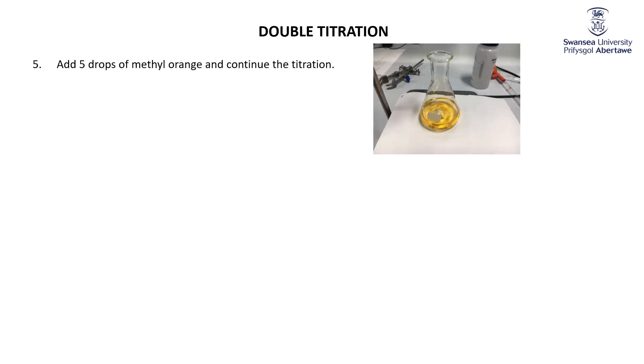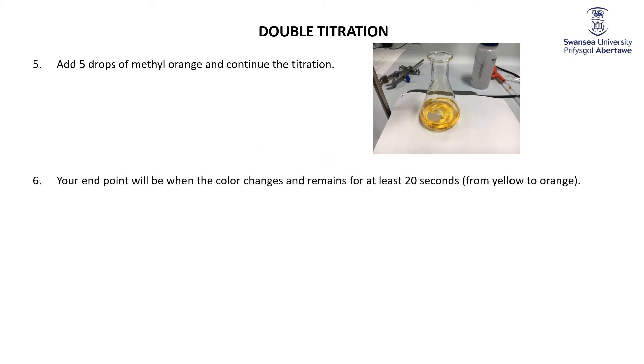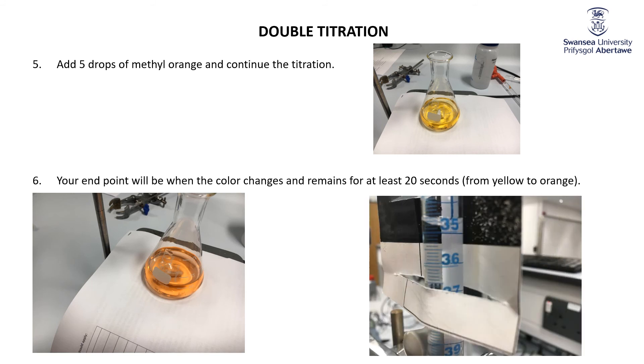Then we add in the methyl orange, which turns it yellow, because now we're on the basic side of the color change — methyl orange is yellow in base. Keep adding the titrant, then at the point where the color changes to orange. That happens at about 34.8 cubic centimeters.